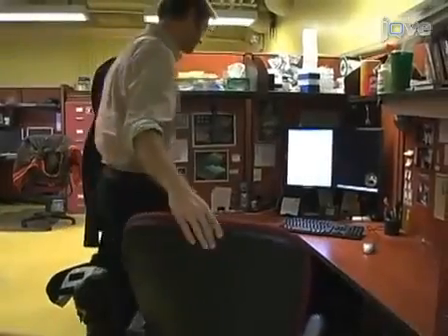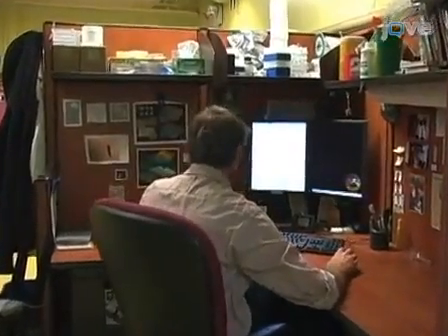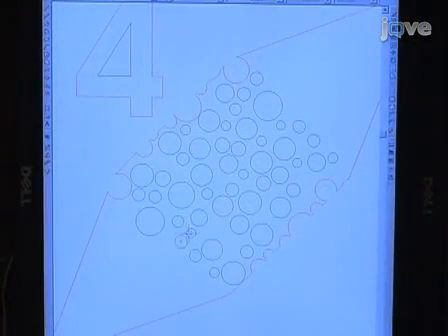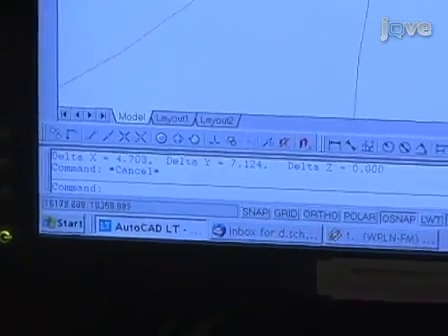The first step in creating a microfluidic device is to draw a two-dimensional layout of the device in a computer-assisted drawing, or CAD program. We have used AutoCAD, but other drawing programs are also available, such as Clewin or CorelDRAW. The software enables the designer to faithfully replicate physical structures throughout a macroscopic field, while individual features are defined at a resolution of less than 5 microns.